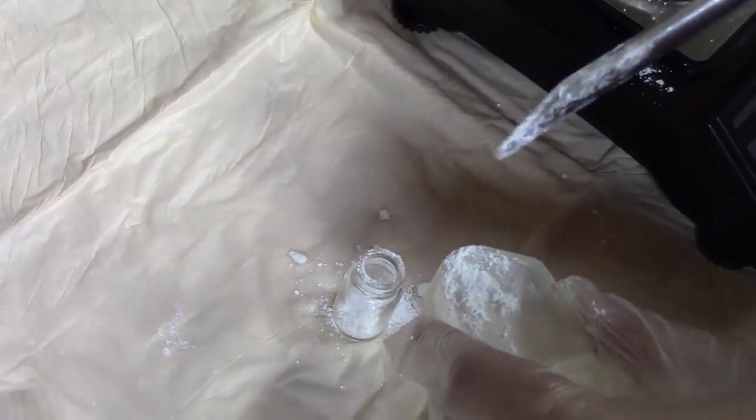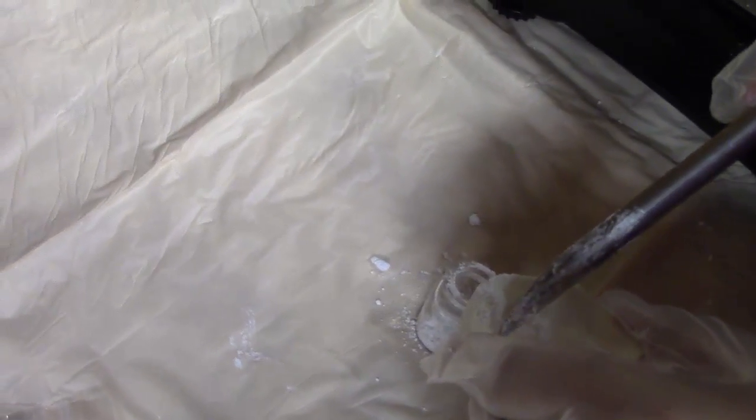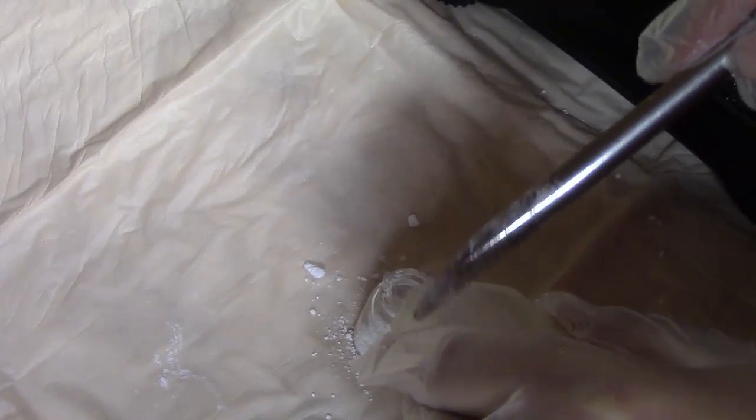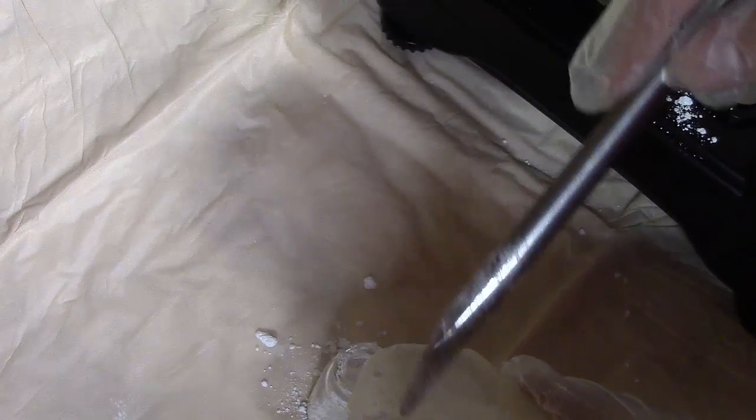The step that created the greatest risk of contamination is the transfer from the weighing bolt to the vial. This is because a small mouthed vial was used for the task. A bigger mouthed vial would have been more suitable.